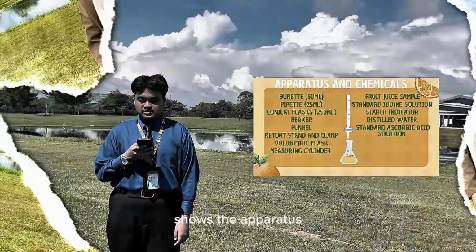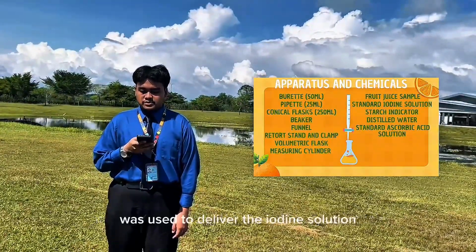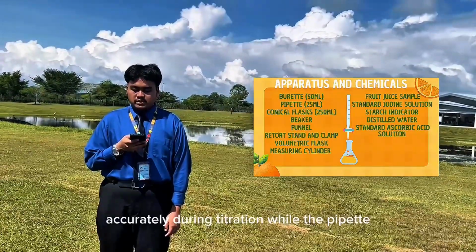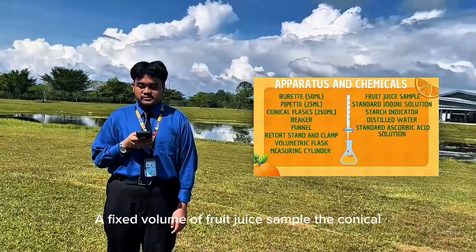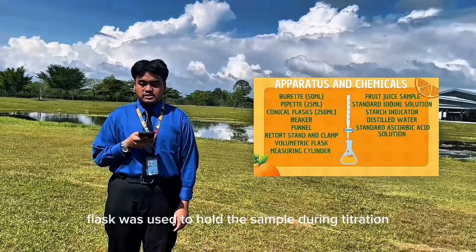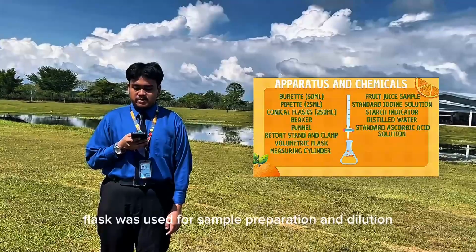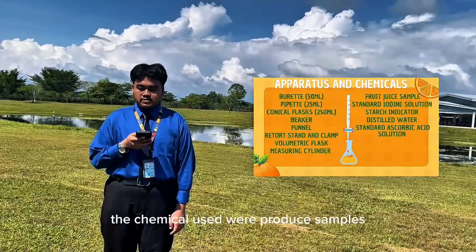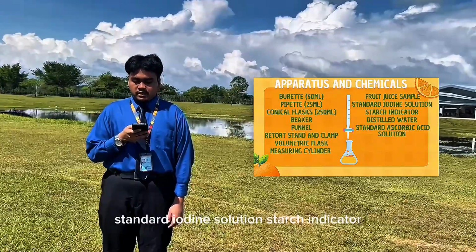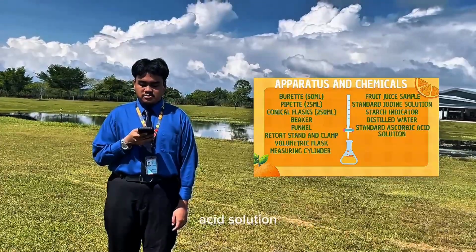The slide shows the apparatus and chemicals used in this experiment. The burette was used to deliver the iodine solution accurately during titration, while the pipette was used to measure the fixed volume of fruit juice sample. The conical flask was used to hold the sample during titration, and the volumetric flask was used for sample preparation and dilution. The chemicals used were fruit juice samples, standard iodine solution, starch indicator, distilled water, and standard ascorbic acid solution.